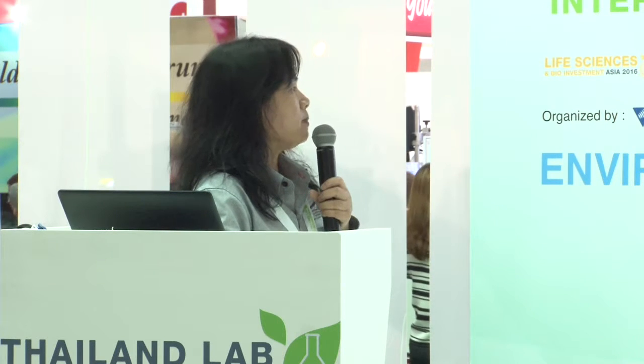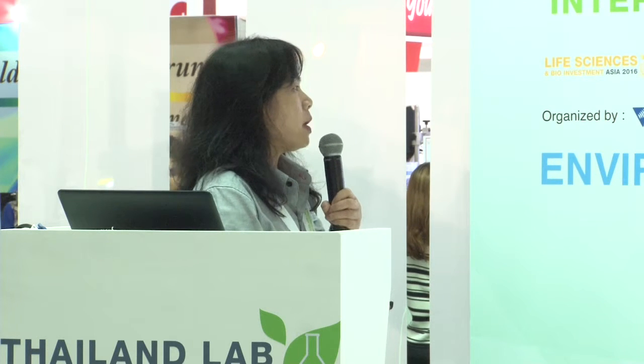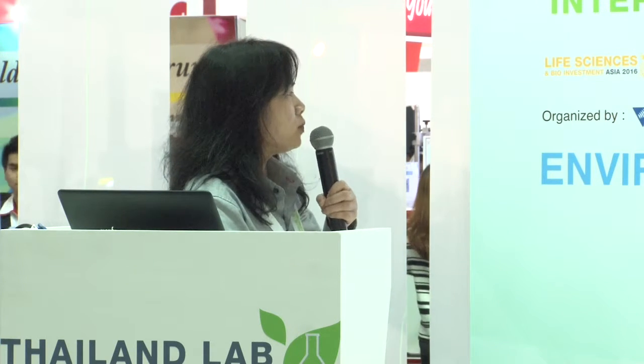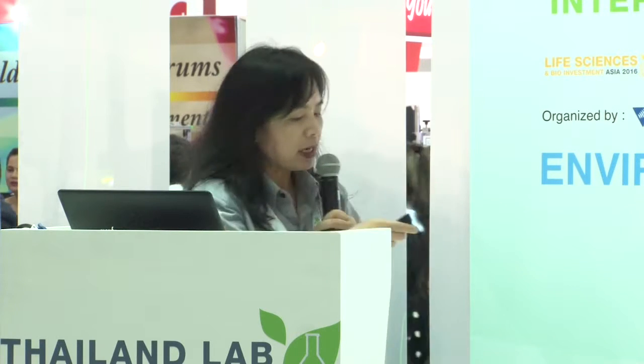Now when I pump in helium gas, it will create collisions. Because arsenic is a single atom, while argon chloride is a molecule, because two means molecule, right? During the collision process, because argon chloride is bigger, it loses its kinetic energy. Losing kinetic energy means it loses energy, so it will slowly be removed from the system. So only the 75, the single atom isotope arsenic, is able to go through the system into my quadrupole. This way of removing interference is called KED, kinetic energy discrimination.